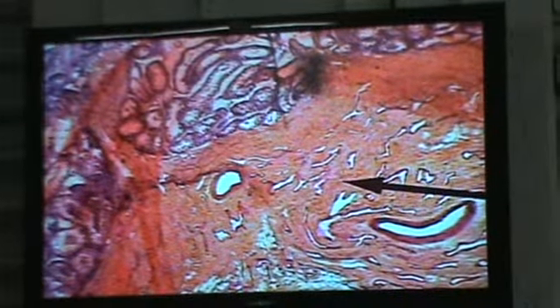So that's a very important, that's a rare diagram to come across. I don't really know which book I got it from, but it's not a diagram that you normally see. So you can make some photocopies of this. It's very good. Alright? So this is the fibrous area known as the mediastinum testis. And there we can see within the mediastinum.